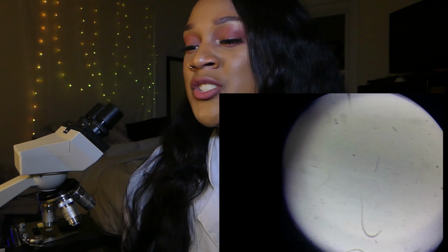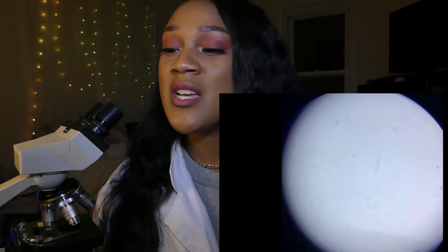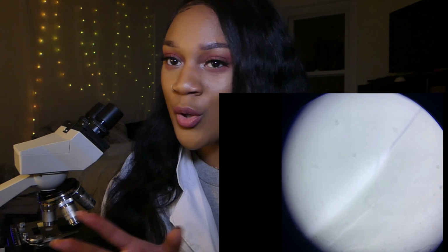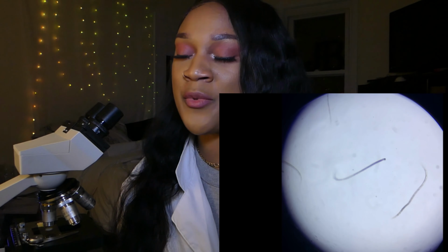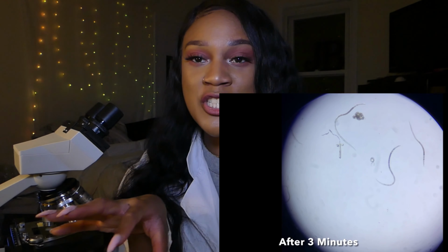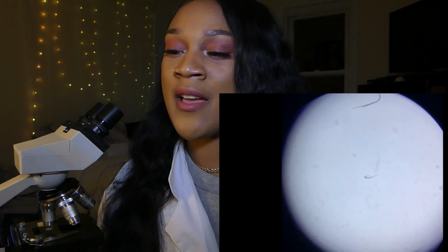So next is alcohol trial 1. This is their natural movement, and I'm adding a droplet now. The alcohol created like a whirlpool, like it threw the microbes into a little vortex, and it was so hard to film because they just kept moving. When I added the alcohol droplet to the microscope slide, it pushed the fluid to one end of the slide.